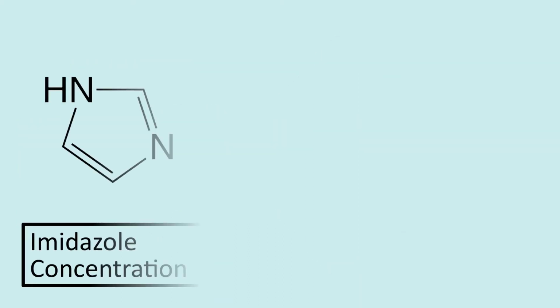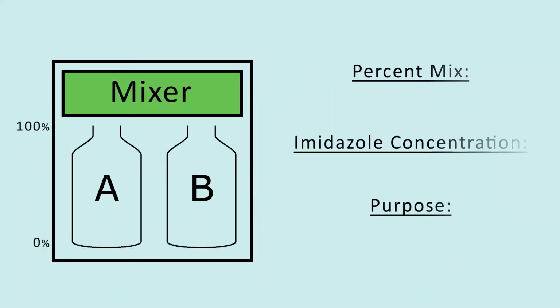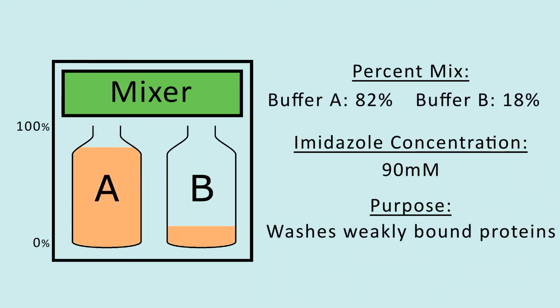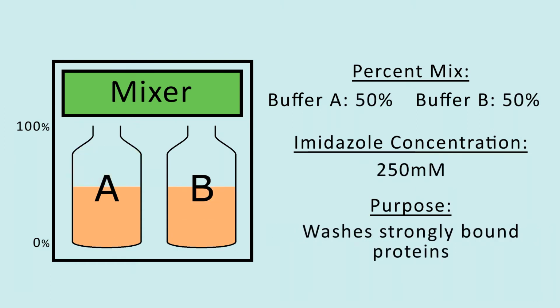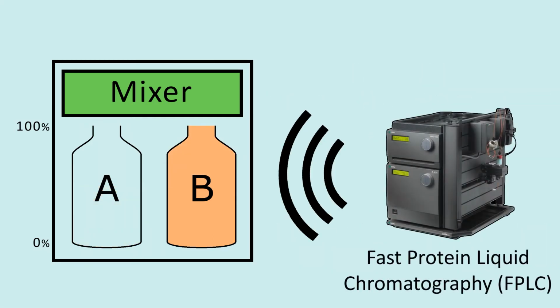Buffer A, the binding buffer, contains little to no imidazole compared to buffer B, the elution buffer, which contains a high concentration of imidazole. Mixing the two together creates a controlled gradient of imidazole, which we can use to accurately wash out the column of any bound proteins. Elution and mixing of buffers is controlled by the FPLC, or Fast Protein Liquid Chromatography machine.